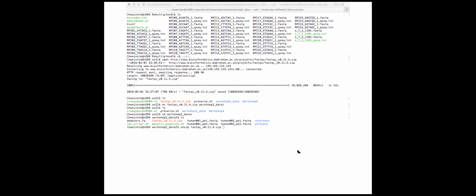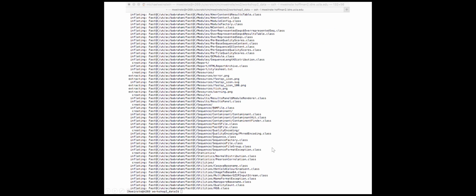And as soon as you unzip it, you're going to see a whole bunch of stuff go across your terminal, just like when you ran the untar command. And that's just the zip file opening up. So I'll give everybody a minute or two on that.